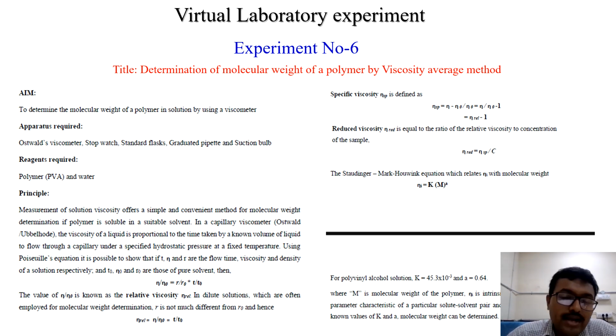For background, first I have to tell you that a polymer solution means a viscous solution. This viscosity depends on the concentration. Say we have a 0.1% polymer solution and a 0.2% polymer solution; the difference is their concentration. If we increase the concentration, there are more molecules, which means more intermolecular force, so the solution will be more viscous. Now we can determine this viscosity. For determination, we have the Ostwald viscometer.